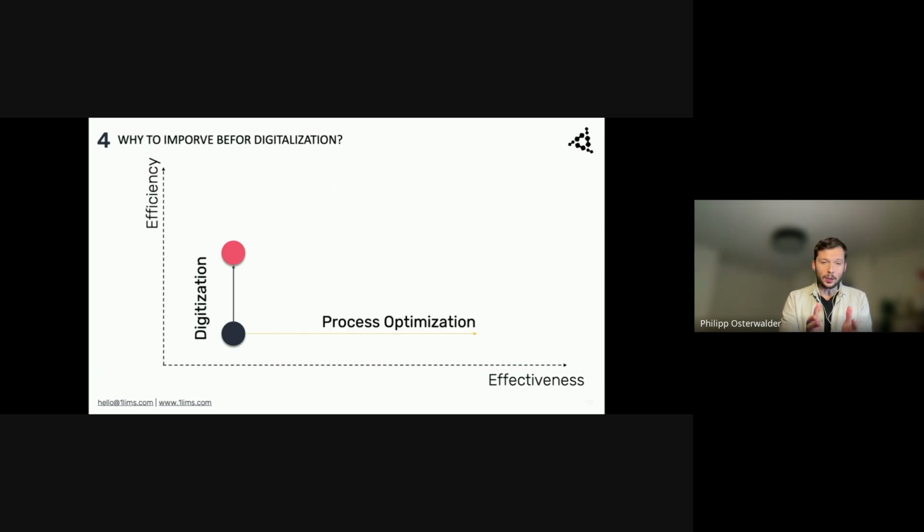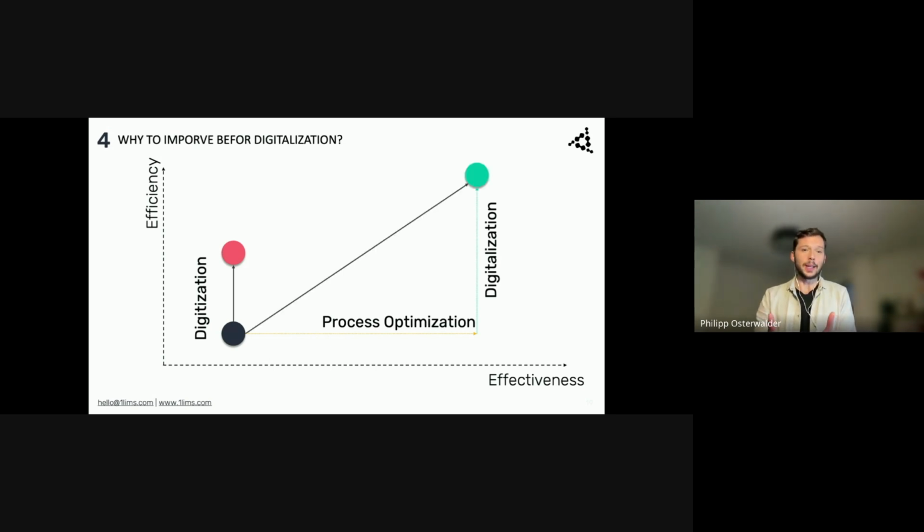Where we start with our one LIMS method is to think of the fundamentals and the principles of this process. What's the goal? What's the format? Where does it start and where should it end? And to reduce it, streamline it, and make it as compact and robust as possible. And then we digitalize those streamlined workflows to gain value in the dimensions of efficiency and effectiveness.